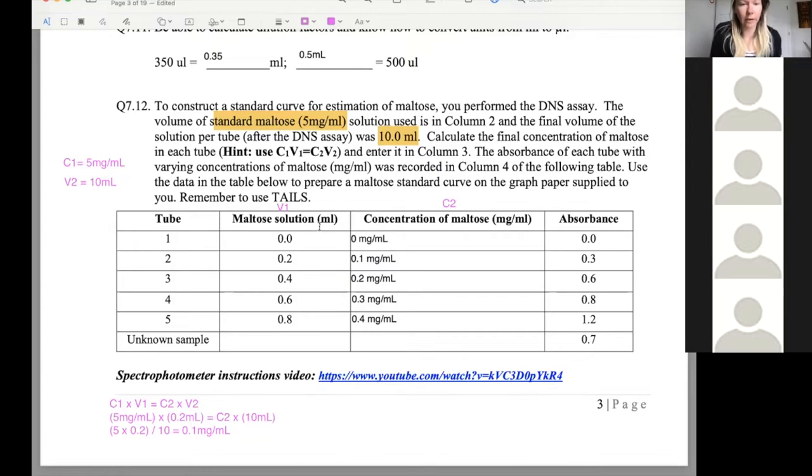All right. So these would be the values you would use to construct your standard curve. And I know it asks you to do that in this review guide. We're not going to make it very precisely. We're just going to walk through how we would make it. Professor, what about for the unknown sample? What do we need to do there? Yeah, so for the unknown, we'll talk about that once we go through how we would set up this graph, because then it will be easier to talk about how we would calculate this. Okay.